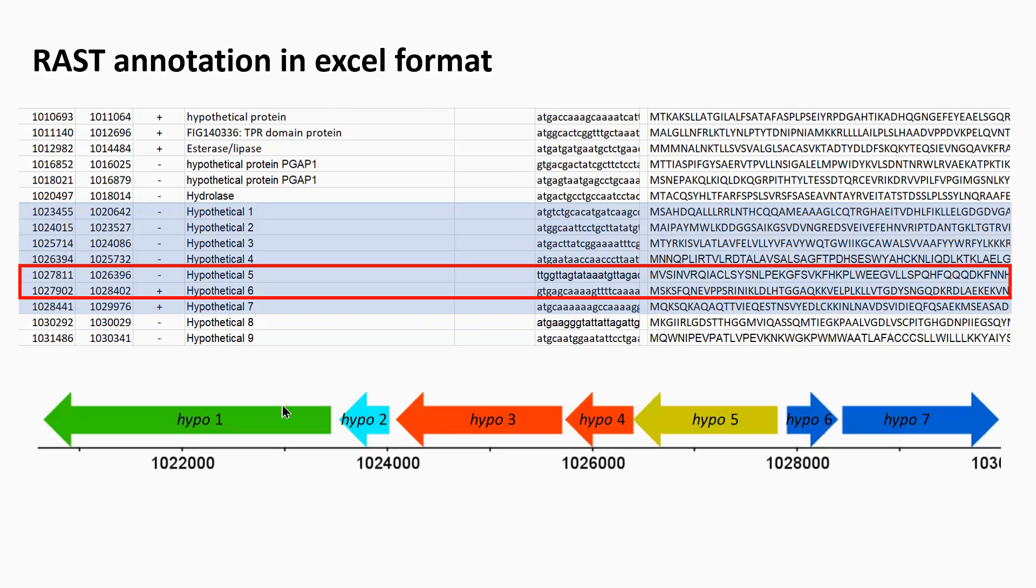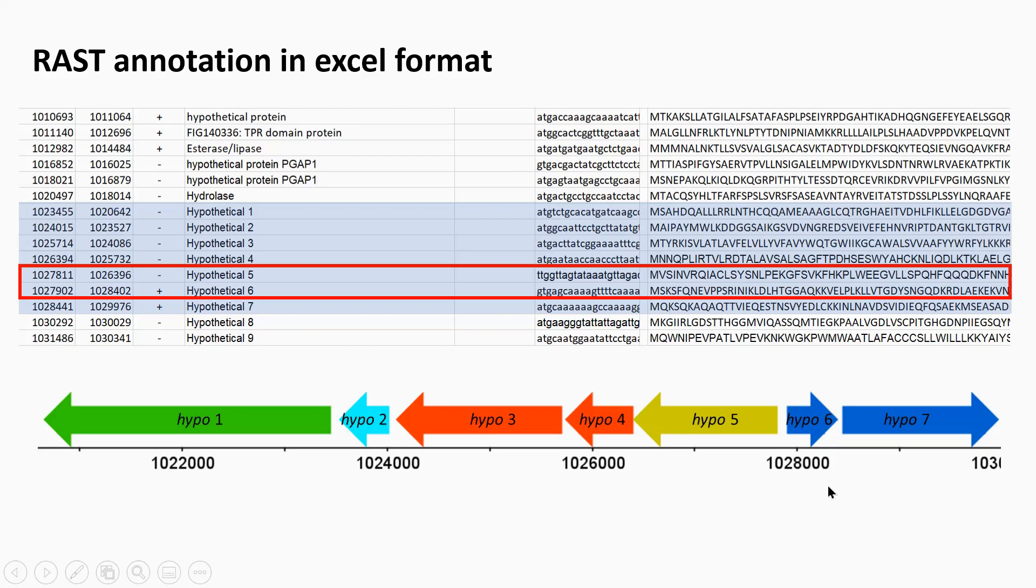I put this information into DNA Plotter just to get a figure for how the genes are arranged. You can see hypothetical gene five is in the opposite direction to hypothetical gene six here. So it's particularly these two out of that cluster that are quite interesting.